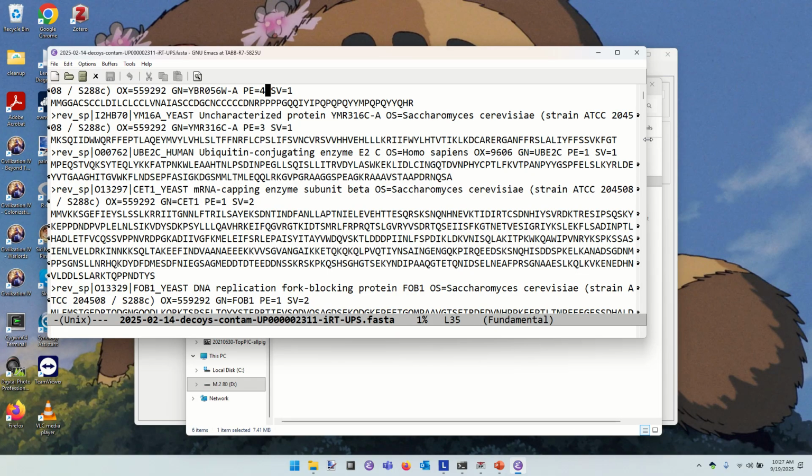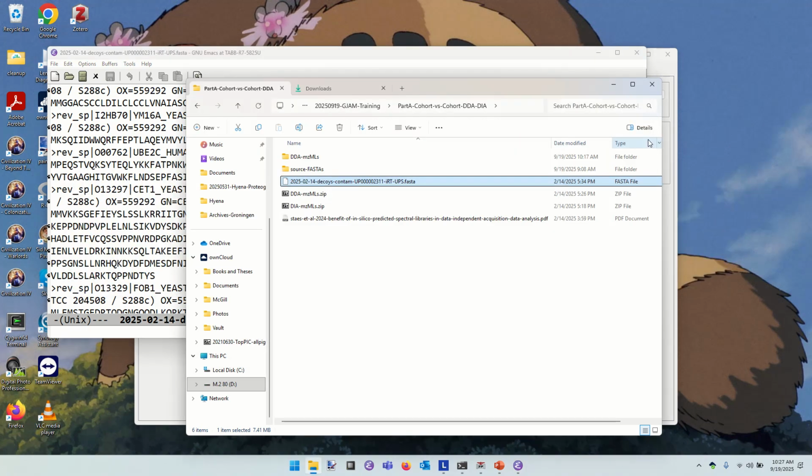The software is going to extrapolate from these protein sequences what peptide sequences could be observed for each protein, given a certain type of enzymatic cleavage. Here we use trypsin. So we provided protein sequences. It turns those into peptide sequences in silico and compares those to spectra. Is it possible to create your own sequence database? Yes, absolutely. But as I mentioned, this one has gone through some steps.